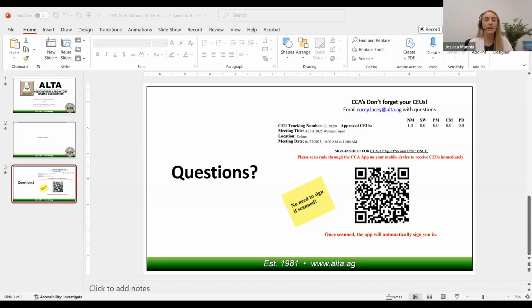And then we didn't actually go in and perform any remote updates of the software when we pushed out and started offering this chemical. So just to keep things easier and to keep the cost lower for the customer, we suggested that for certain instruments specifically, I know the Rapid and Exceed is one of them, I think the Vario Macro Cube may be another, it's just easier to remove the tubes and to go through any update to the leak test, which would have to change the expected flow.